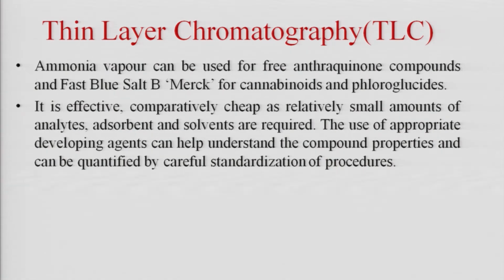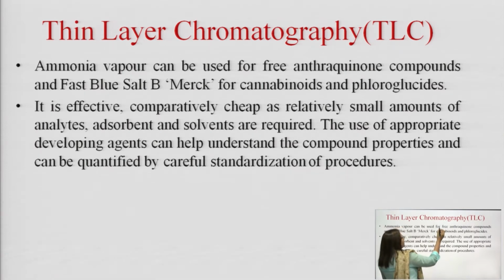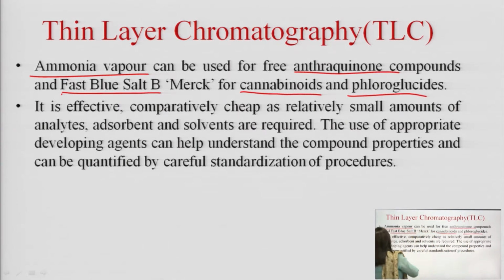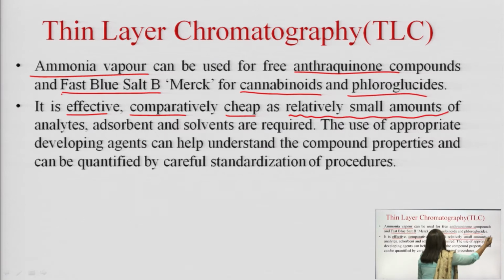So, there are some more examples under our consideration, like the anthraquinone compounds. They are easily visualized by ammonia vapor, and then we have this fast blue salt B, which is used for visualization of cannabinoids and phloroglucinol-like substances, okay, and it is again effective, comparatively cheap, and a relatively very small amount of the analytes can be easily separated, analyzed or assessed utilizing TLC.